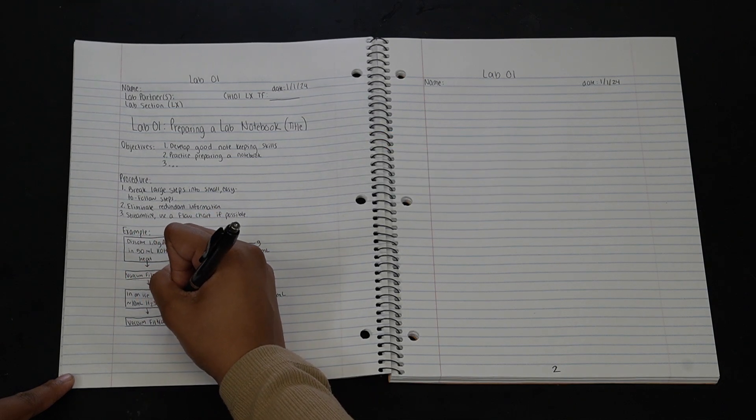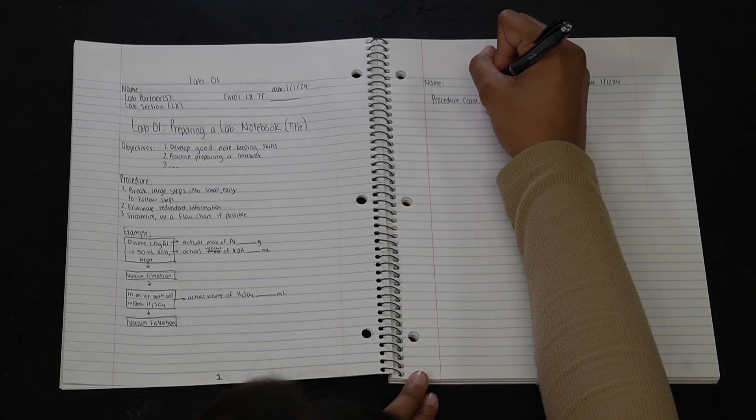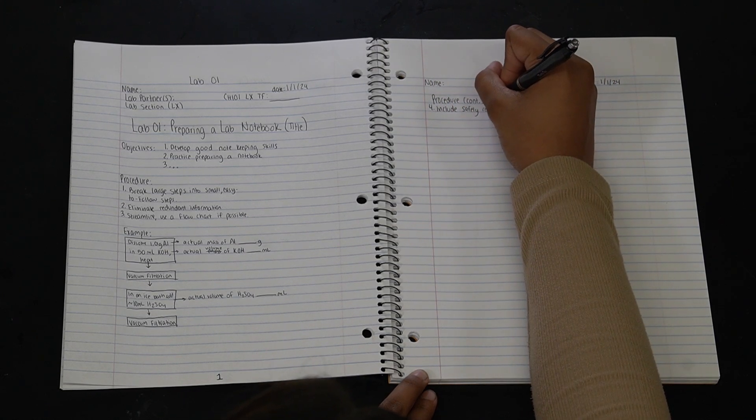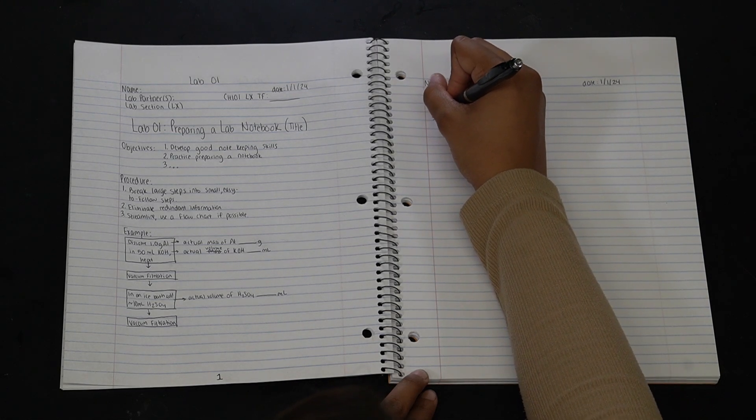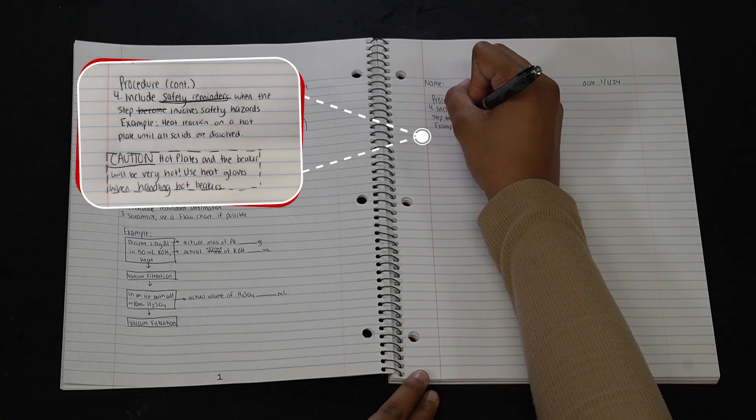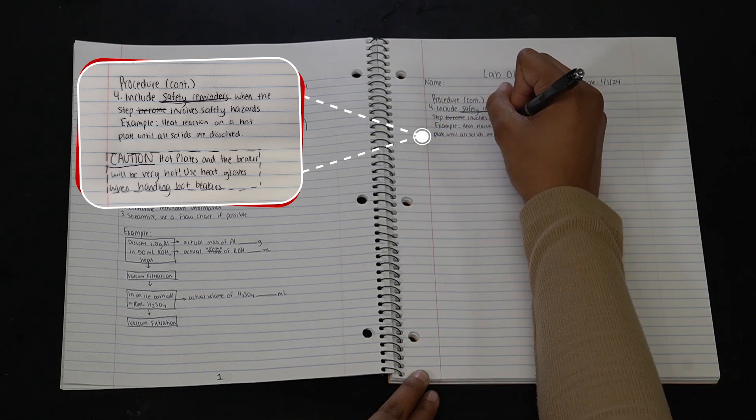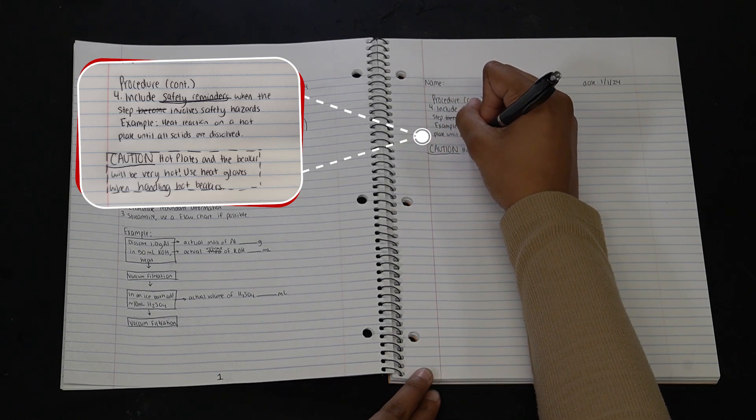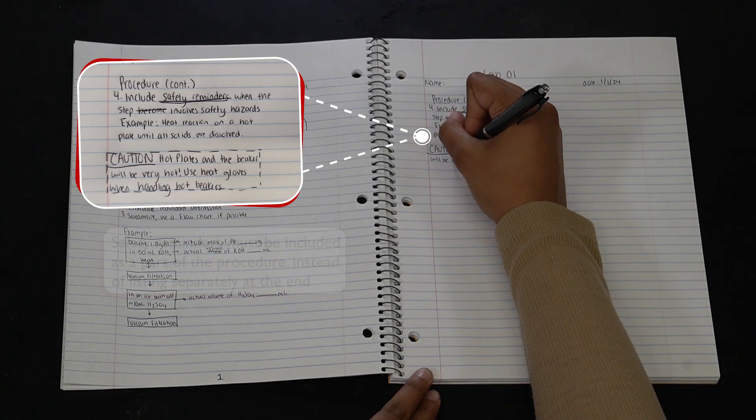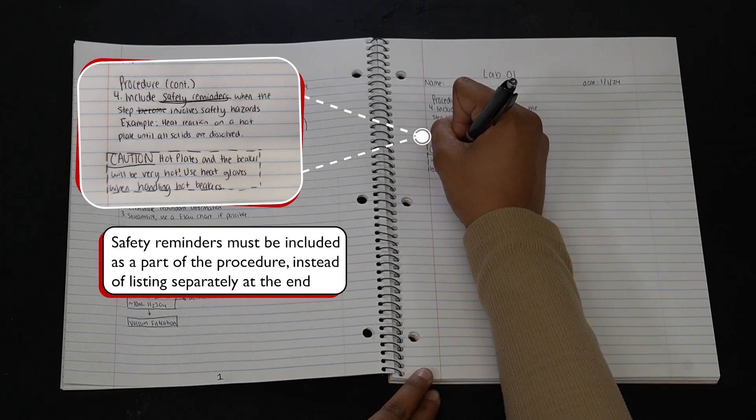We should always include diagrams or flow charts where applicable. While it is recommended that we only write down a simplified version of the experimental procedure, there are a few additional details that we should pay special attention to. First, we should always include important safety reminders when a step involves the use of a hazardous chemical or a potentially dangerous operation. The manual will provide safety reminders. We should always include those and highlight them in our notebook so that while performing the experiment, we are fully aware of the potential danger of the step. Some experimental protocols list safety hazards and waste handling instructions at the end of the procedure. That's not very useful. They must be included at the relevant steps in the procedure.